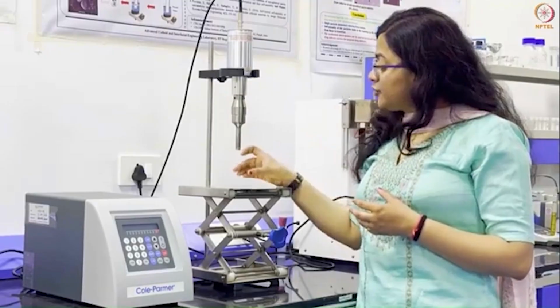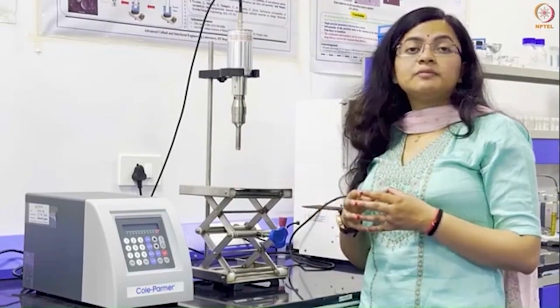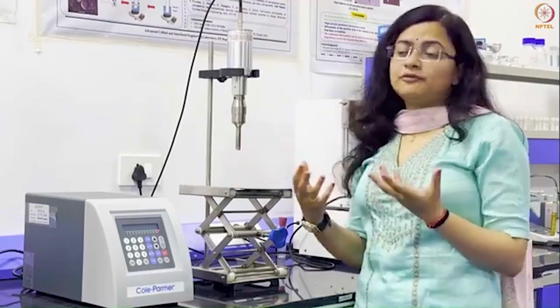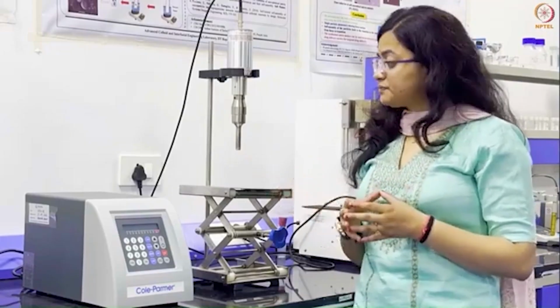Here we have to put our sample holder. Here is the place for the sample holder, which should fit in size with the probe, and it should be made of glass or plastic, and it should be compatible with the sample.